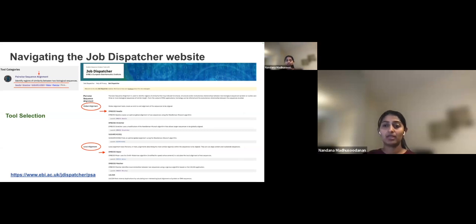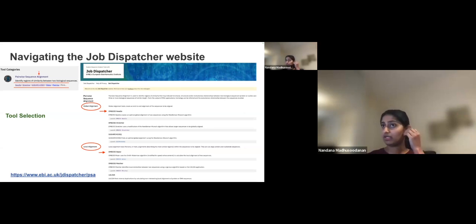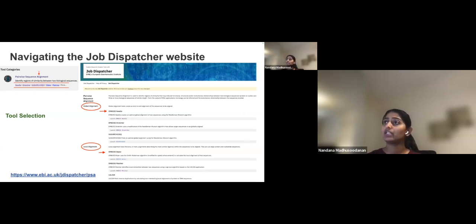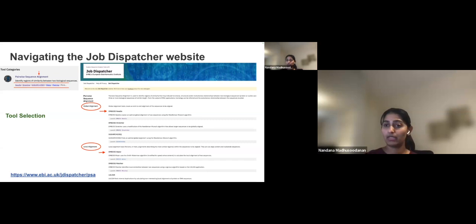This is an example of a pairwise sequence alignment tool page. It has more detailed information about what the tool does and lists the available tools. We encourage users to go through the tool category page before starting any analysis, as it will give you a better idea about which tool to use.